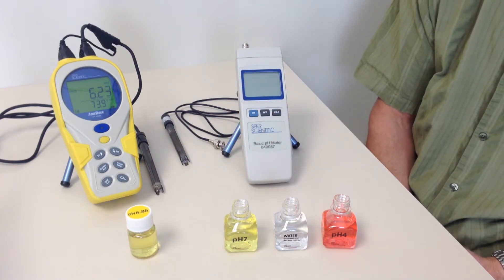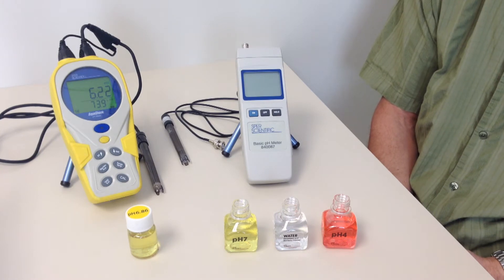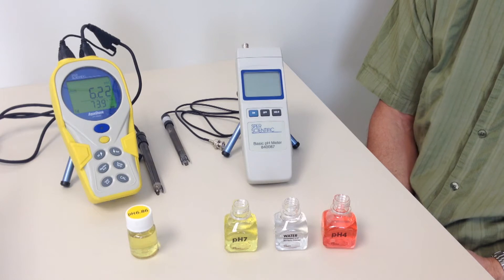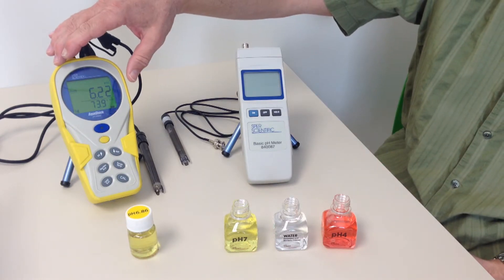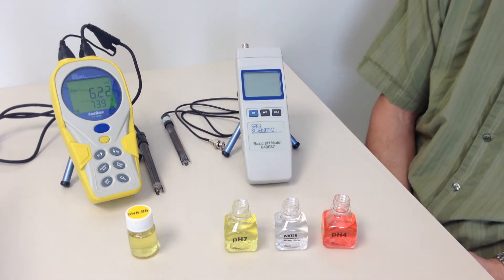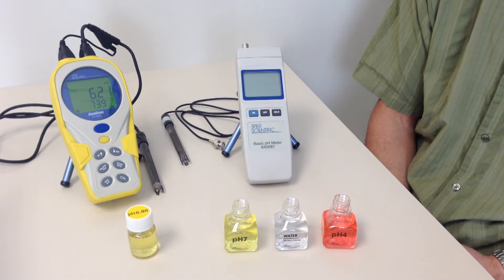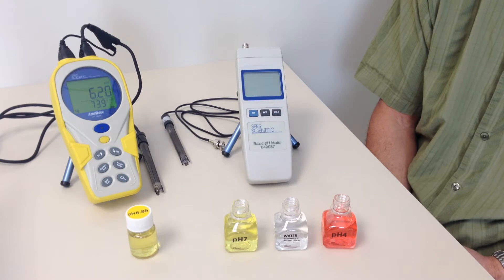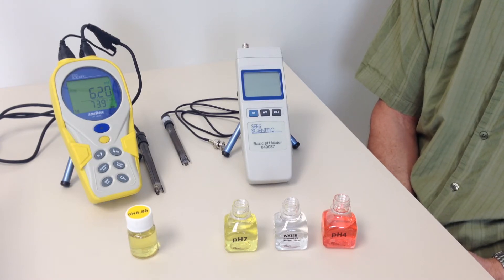Some meters require you to adjust a potentiometer to do this, which is known as manual calibration. More advanced meters, like this one, recognize and calibrate to the buffer solution automatically with the push of a button. This is known as automatic buffer recognition. In this video, we'll demonstrate pH calibration using both manual and automatic meters.